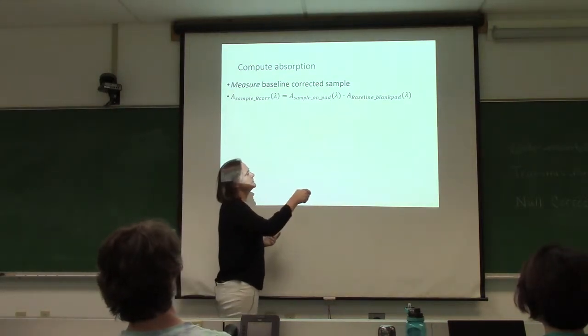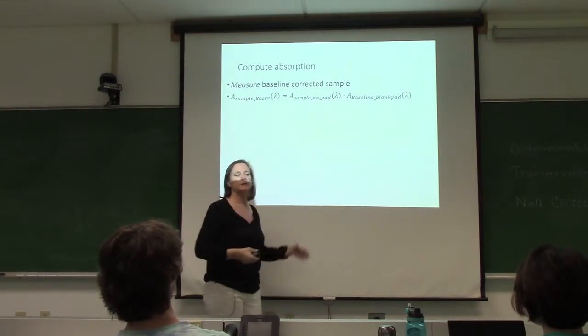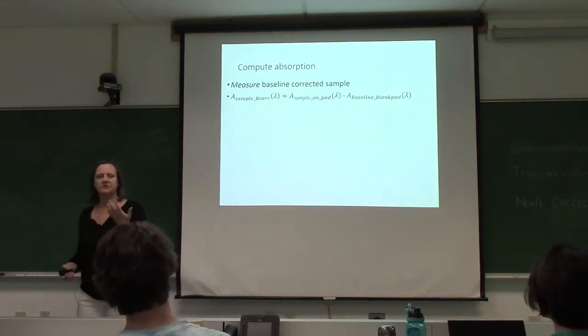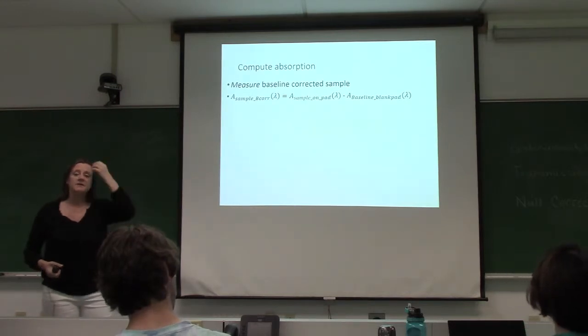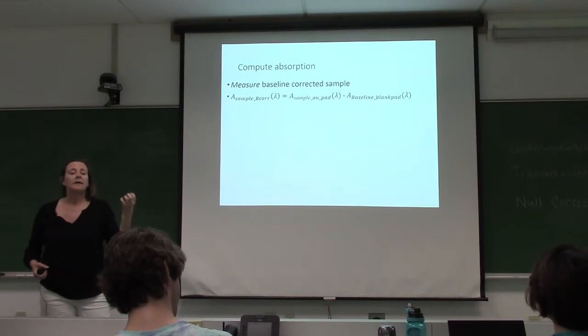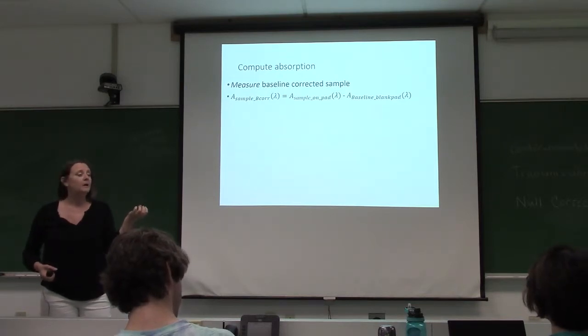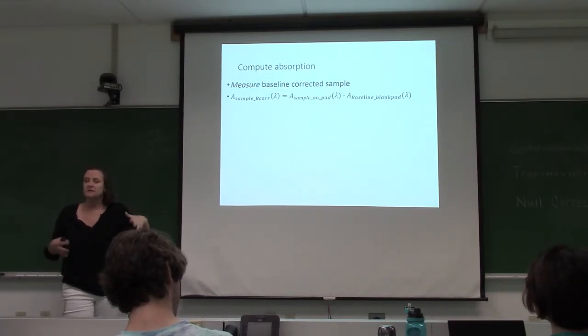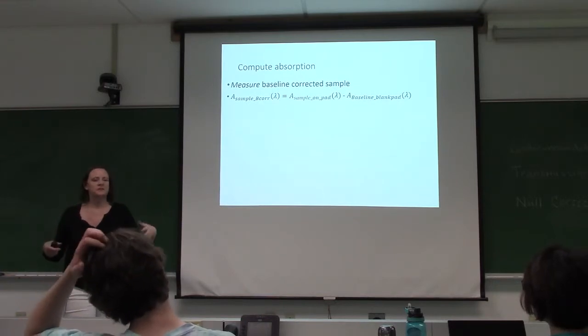This is the first measurement that you make when you put a blank filter pad into the spectrophotometer and you make a measurement. That's your reference measurement. In our spectrophotometer, you can have it store that scan, and it will automatically subtract it from all of your sample measurements, which is helpful because then what you look at on the screen is your sample and not your sample plus the instrument noise and the filter pad and all of that.